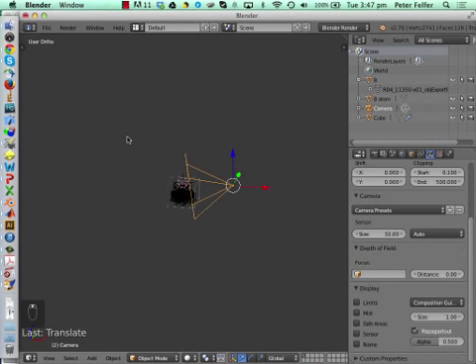The next thing that we're going to do is simply animate the camera. If you want to animate, you usually do the stuff that Iris has, where it spins everything by 360 degrees. What we're going to do is not spin the data. We're going to move the camera rather than the data. That's a better way of doing it.